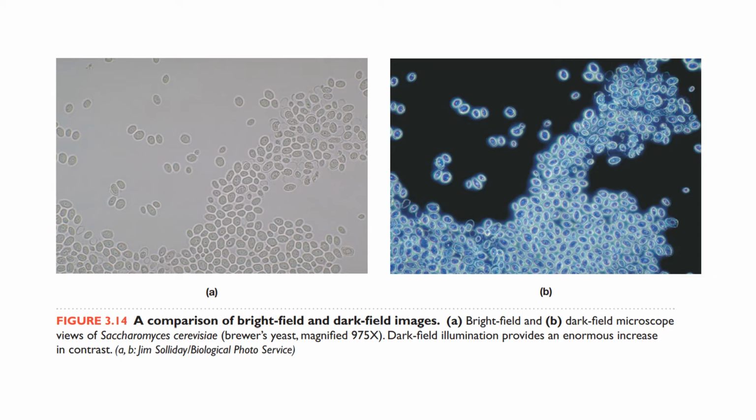Again now, but this time we are seeing bright field microscopy images and dark field microscopy images. Now, the bright field microscopy image, as you can see, is not clearly visible. See guys, whatever you're seeing for the bright field microscopy image, it is even lighter than this. It's a photograph of whatever you are seeing on the slide. Whenever you're seeing this image on the microscope, it'll not be this clear.